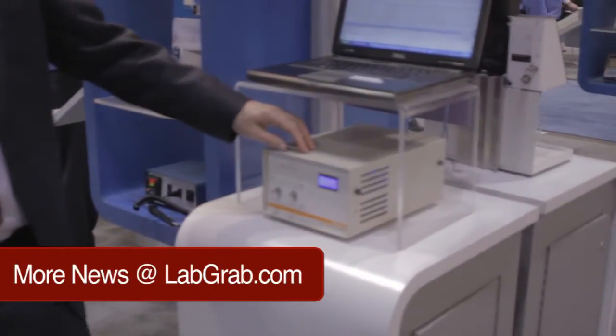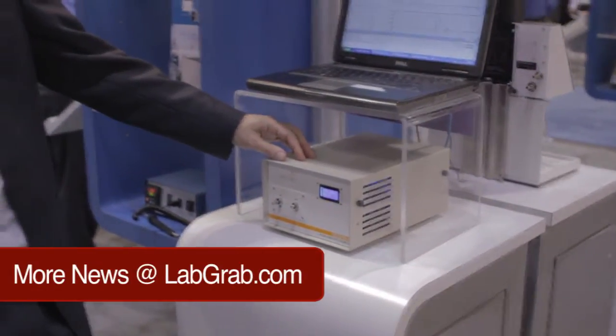I'd like to show you our PicoSpin miniature spectrometer. So this is it. It's a 45 MHz liquid phase proton NMR spectrometer.